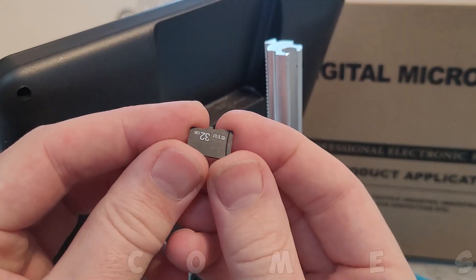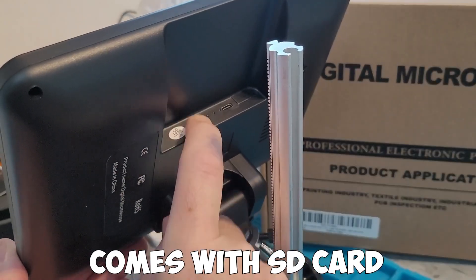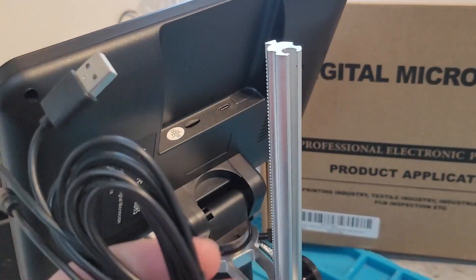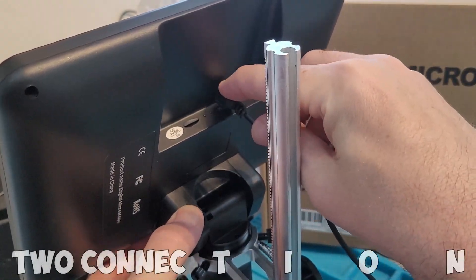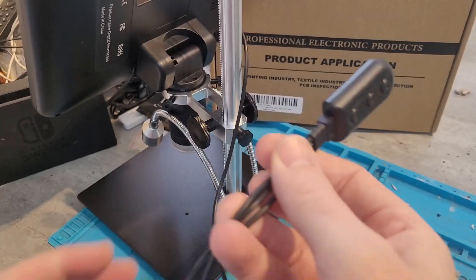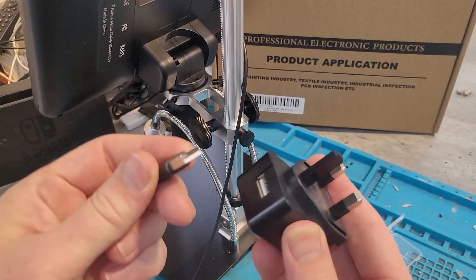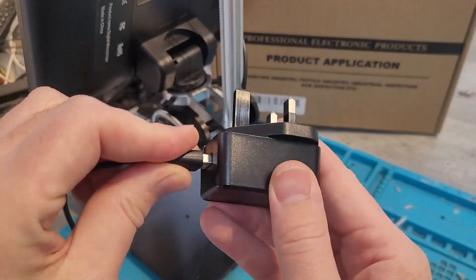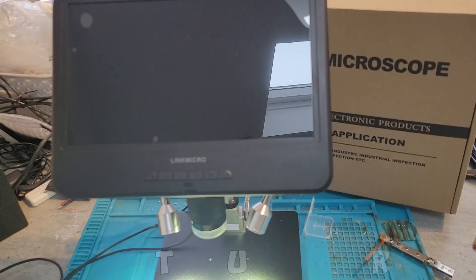To set up, the 32 gig SD card simply slots into the back — make sure you pop it in the right way. There's also a USB connection that plugs into the top. The other plug goes into the base to power the light, and that connection plugs into the USB plug. Then press the power button and it turns on.